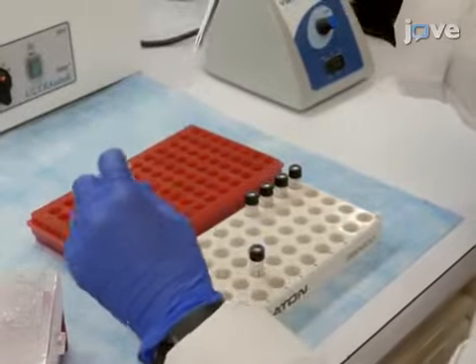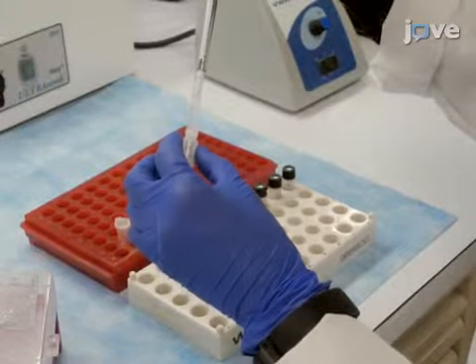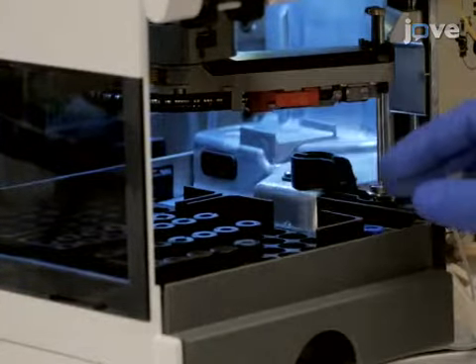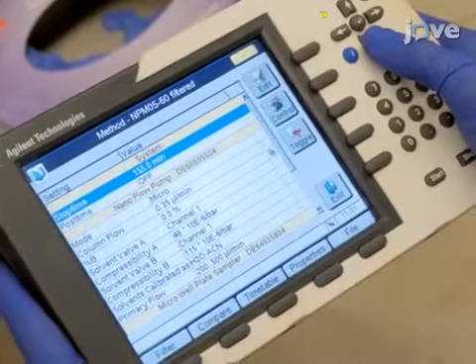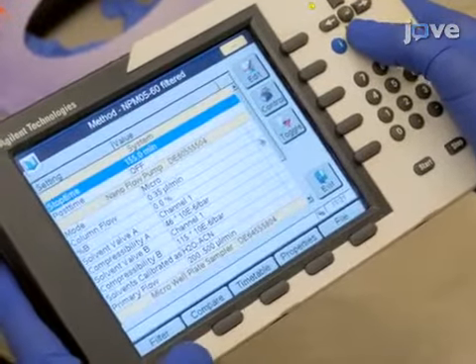Analyze the mixtures of the external peptide standards at approximately 1 to 10 picomoles of each peptide per injection by shotgun mass spectrometry using a nanoflow HPLC system coupled to a triple-quadrupole mass spectrometer as detailed in the text protocol. Ensure that each LC-MS run includes a 60-minute linear gradient, a column regeneration step, and a column reequilibration step.